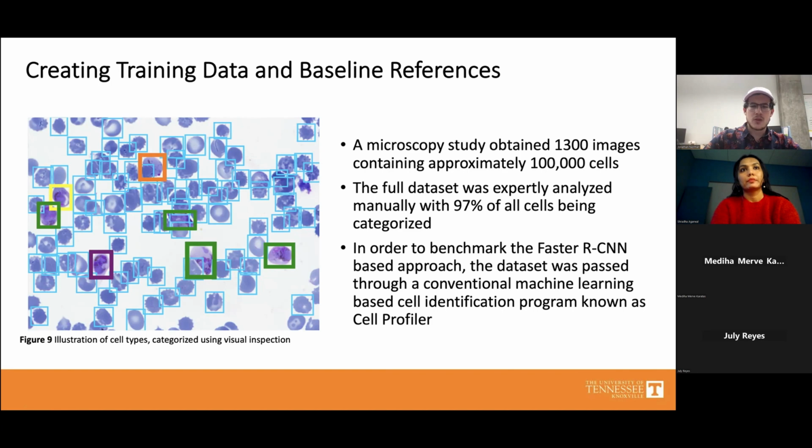In order to do a good quantitative study, because the goal here wasn't so much to go through all of these images and actually identify malaria cells. It was more to create this neural network as a tool for future research. Because presently, convolutional neural networks for image analysis have been frequently used for biological imaging, but one of the big problems is that most of the time the information remains proprietary and it never actually gets published as a functional tool for other labs to use. This study really wanted to change that by actually creating a useful implementation of computer vision for future research.